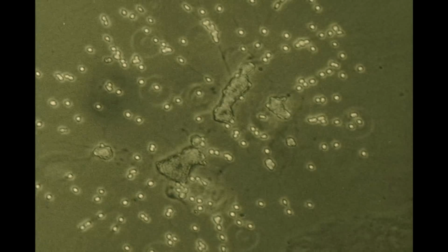The network within which the cells glide is produced by the cells themselves, and is laid down ahead of them as thin filaments which coalesce into larger strands.